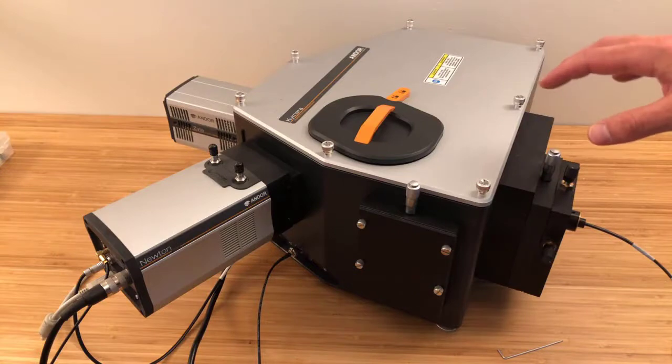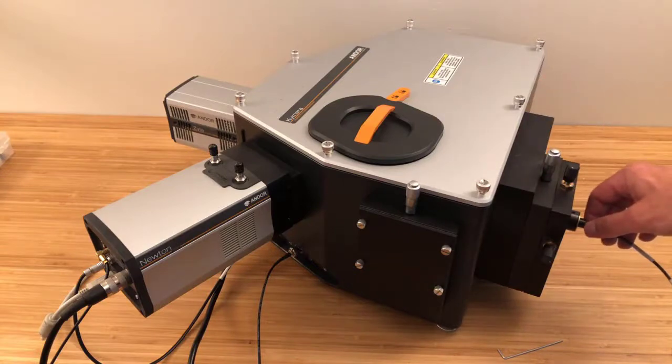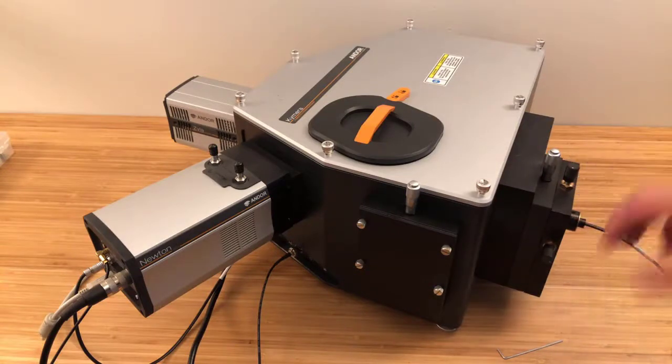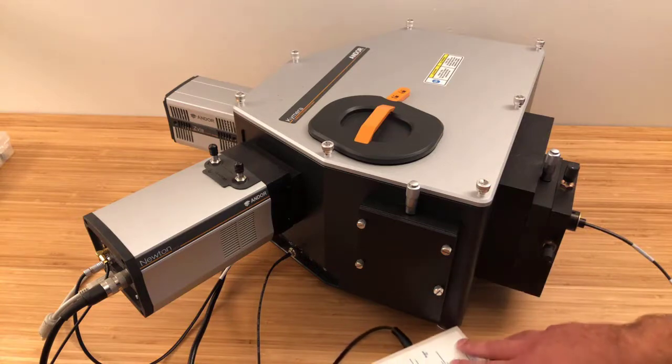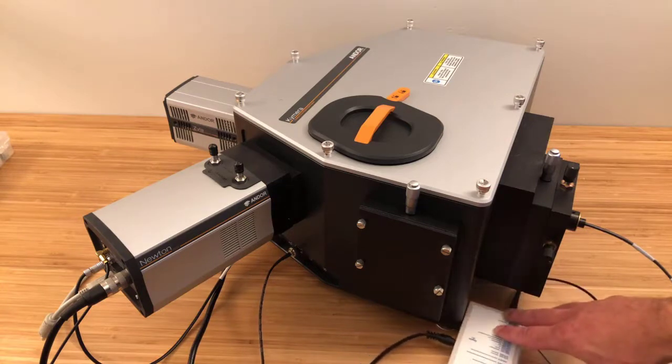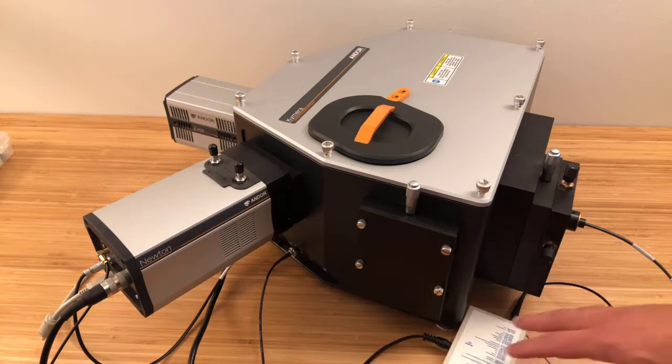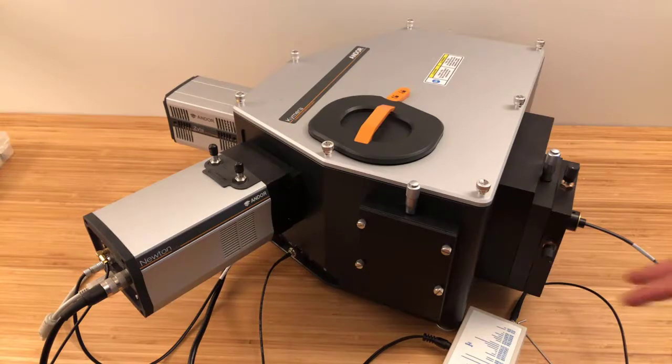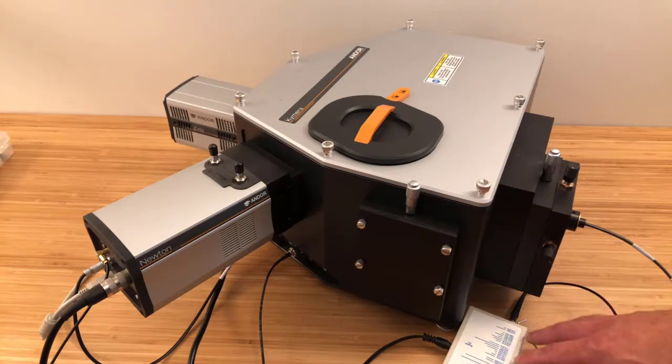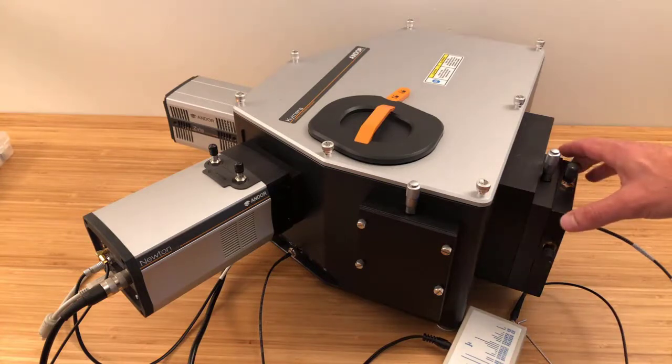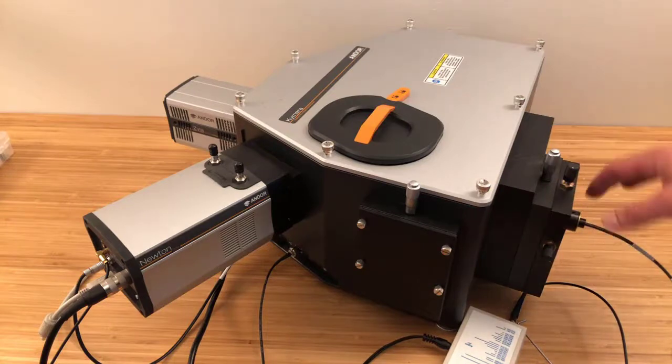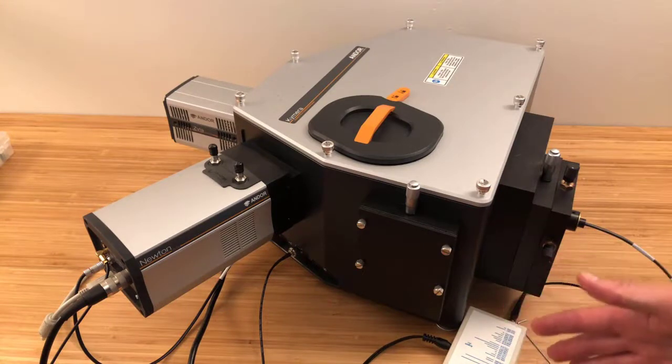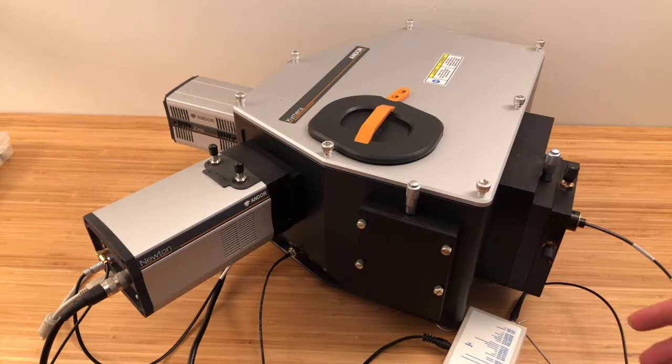But we have a wide variety of accessories that you can see on the Chimera 328i spec sheet. I also have a fiber, an SMA fiber, going to the input port here from this calibration lamp. And this is a mercury-argon calibration lamp, which is very useful because it has a wide variety of narrow spectral lines over a very broad spectral range, which is useful as a wavelength calibration standard. And it's conveniently fiber coupled, which makes it very easy to set up. So I just attach my XY fiber adjuster here, put the ferrule in, tighten it, and then connect it to here, turn it on, and I have a fantastic calibration standard.